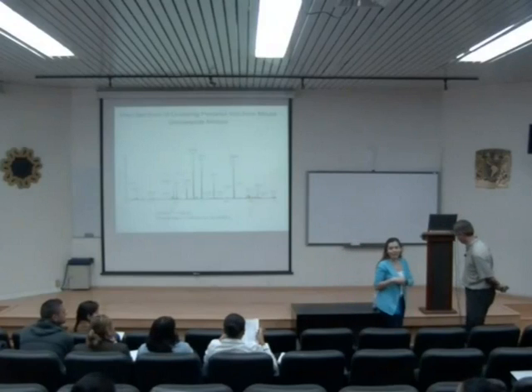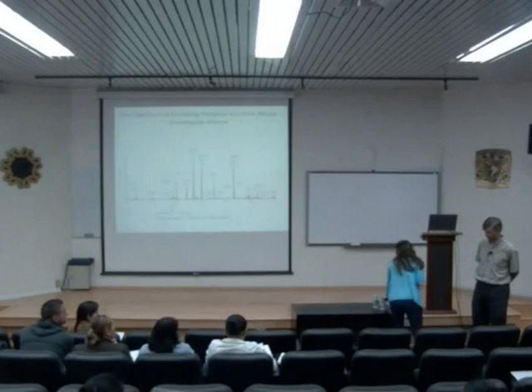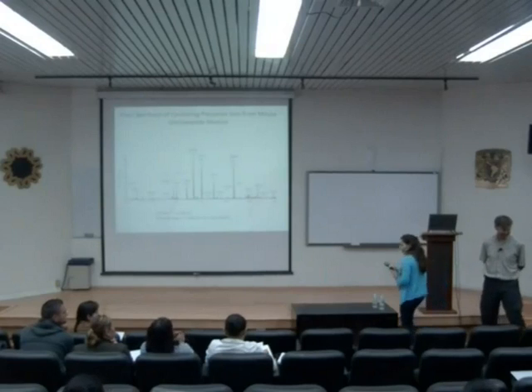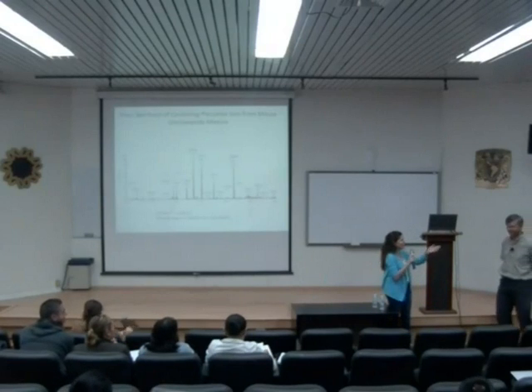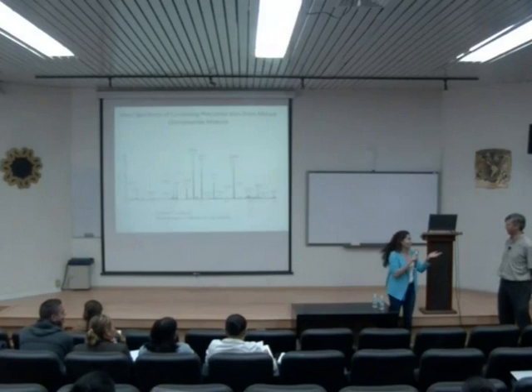So we're going to start the case study session, only one session, for mass spectrometry analysis of glycoconjugates or glycopeptides.